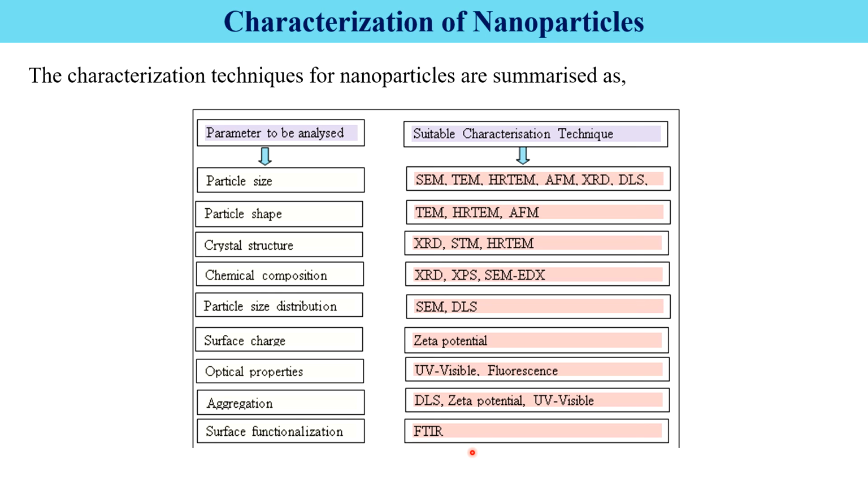These are some common techniques used for characterization of nanoparticles. Nanotechnology is a wide subject. There are a number of parameters we have to analyze, but for beginners, the nanoparticle should be gone through these characterization techniques.